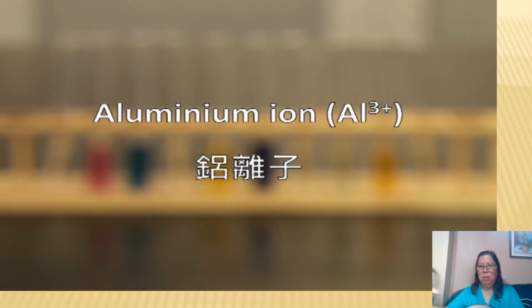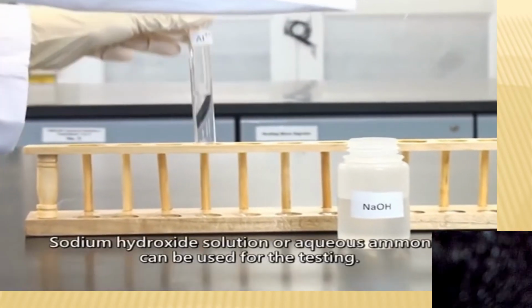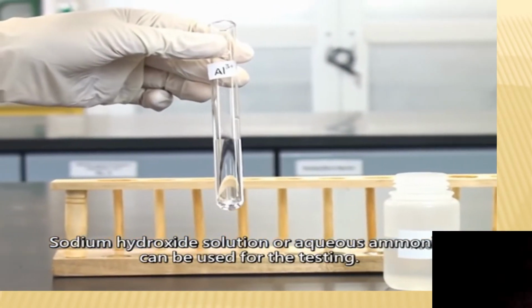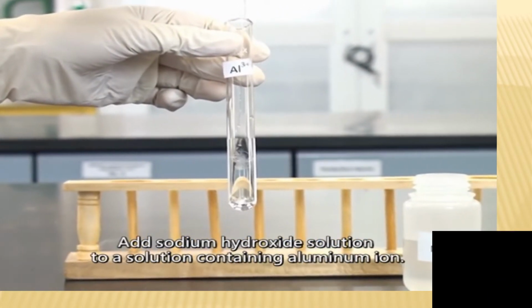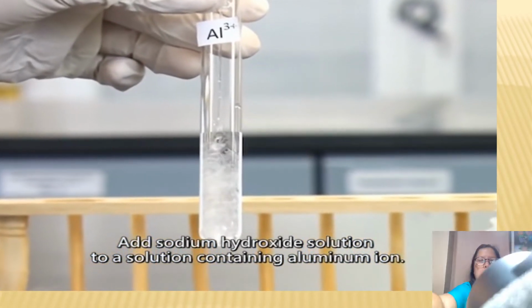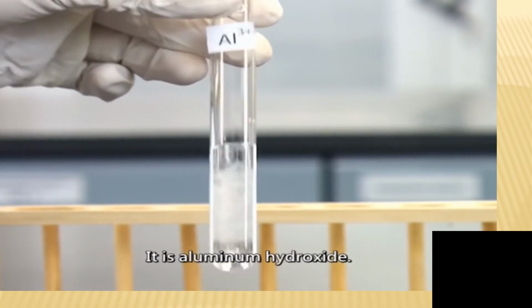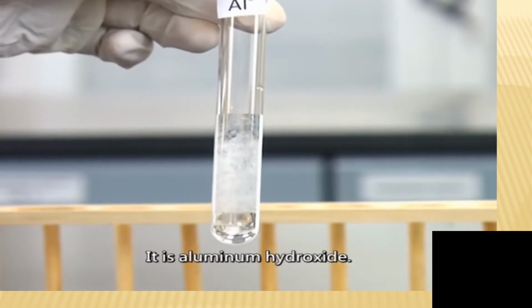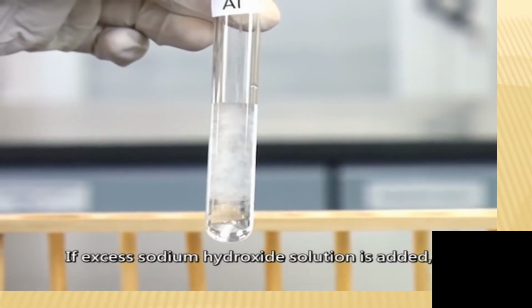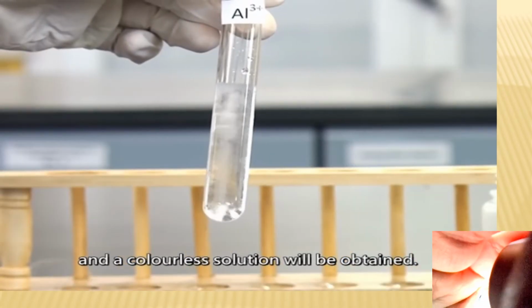Aluminium ion. Aluminium ion is a colorless cation. Sodium hydroxide solution or aqueous ammonia solution can be used for the testing. Add sodium hydroxide solution to a solution containing aluminium ion. A white precipitate is formed. It is aluminium hydroxide. If excess sodium hydroxide solution is added, the white precipitate will dissolve and a colorless solution will be obtained.